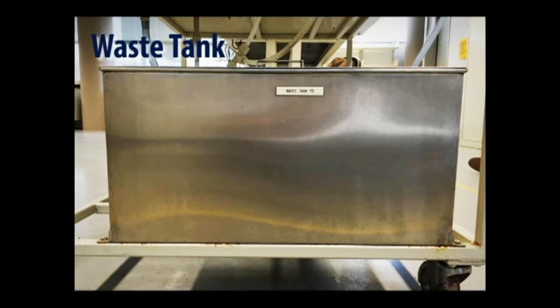The waste tank is a rectangular tank with 50 liters of capacity made up of stainless steel. It is placed at the bottom of the equipment.